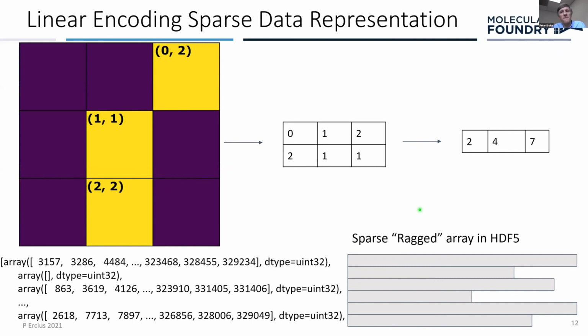They're all going to be fairly similar. They're not going to be different by major factors. The electron microscope, for us, outputs a certain number of electrons per 11 microseconds. And so you kind of understand how big they're going to be. The standard deviation of the size of that is not humongous.